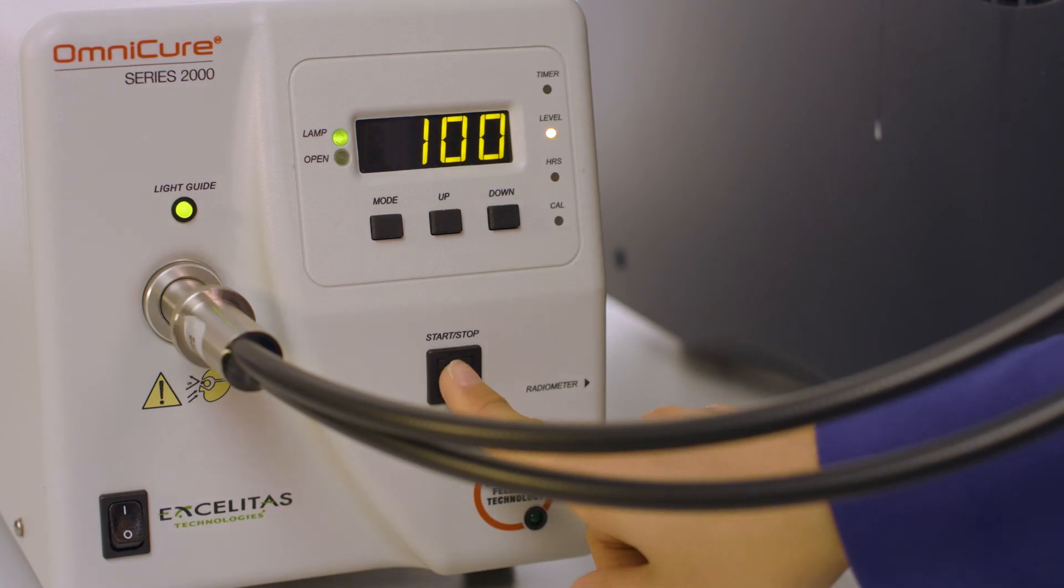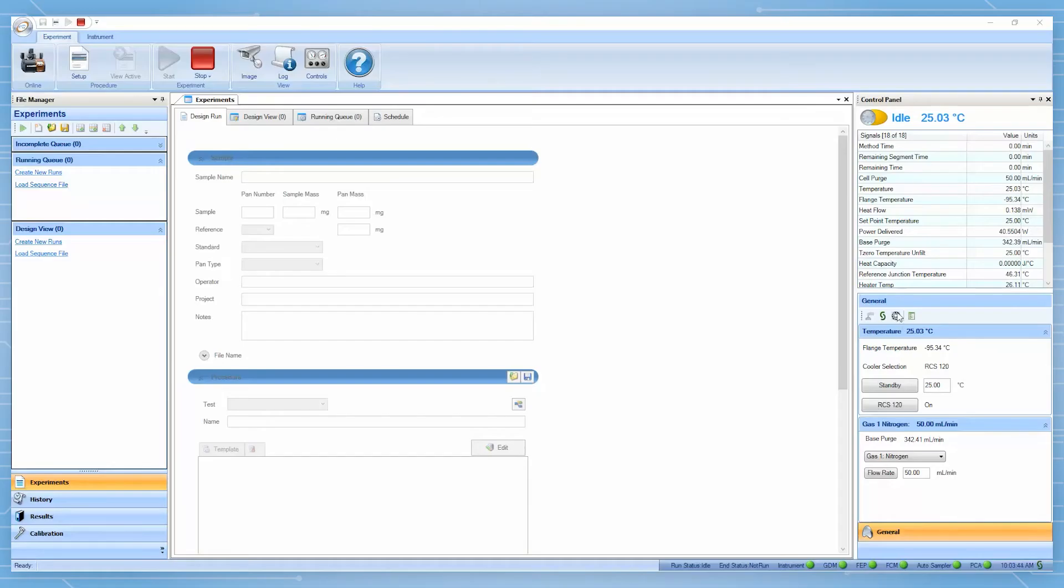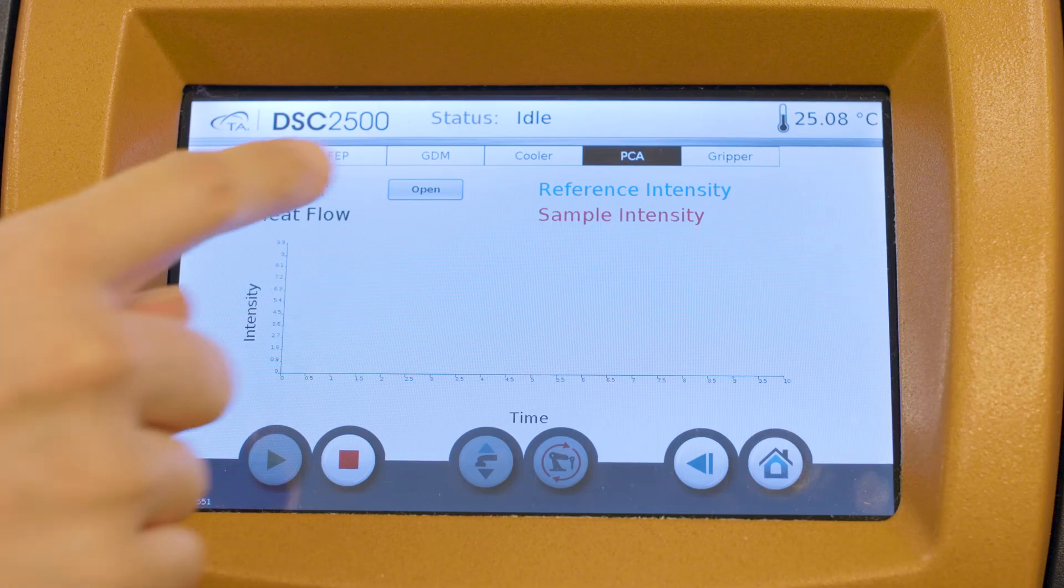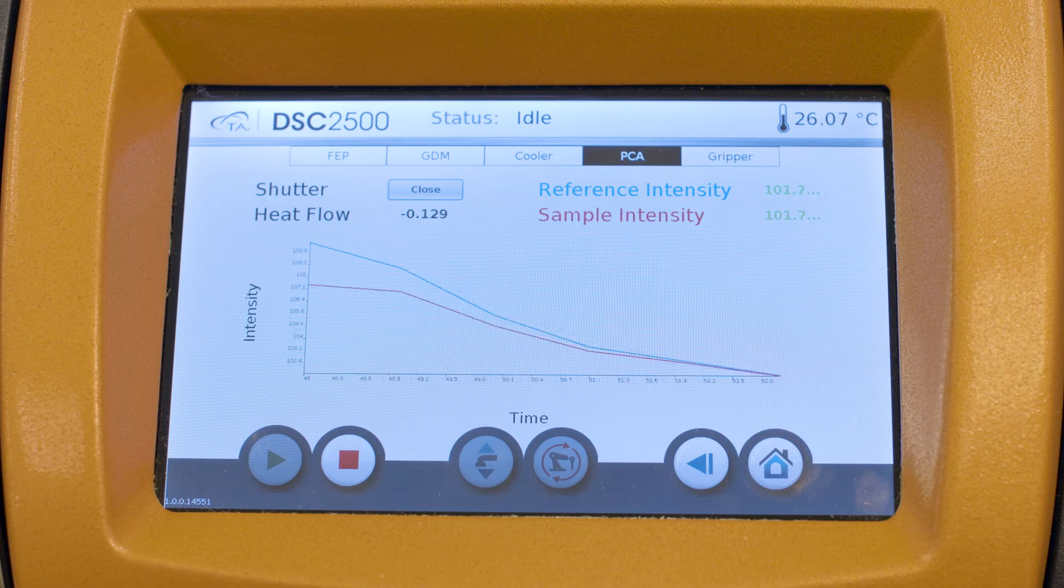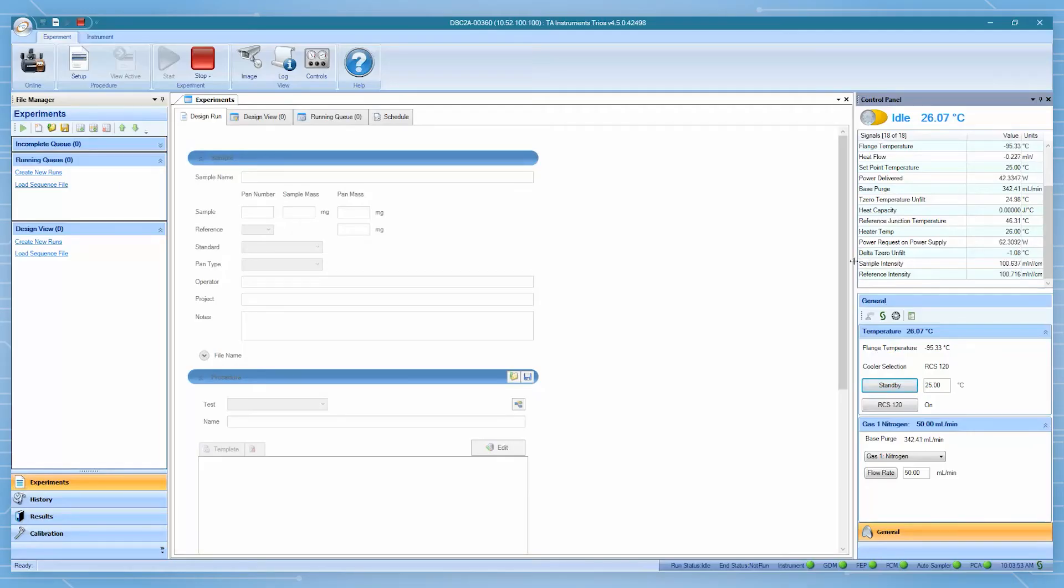Open the shutter either from the light source, the software, or the touch screen. Perform intensity adjustment and balancing process while monitoring the signal displayed on the touch screen or on the TRIO controller.